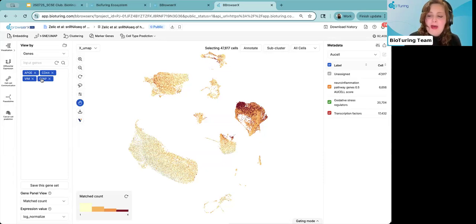It's whether you're trying to map out an enrichment or you're trying to identify cell subtype populations that would require more than one gene to identify that cell type. There might be cases for Th2 cells that might need the expression of not just one gene, but you might need to run very specific markers and an AUCell enrichment to see if you have that population within your data set.